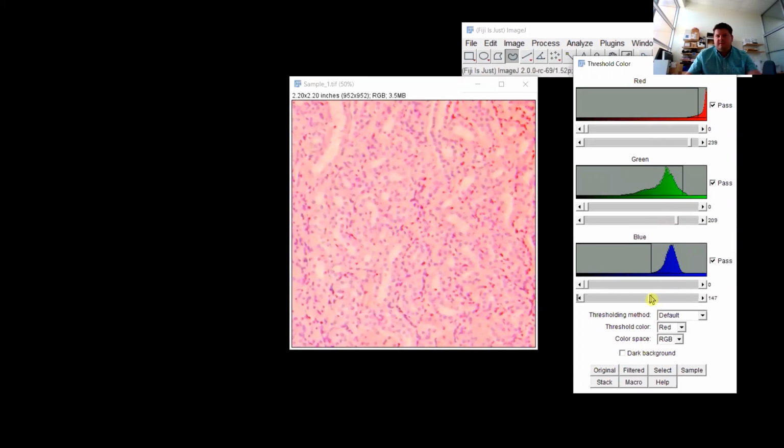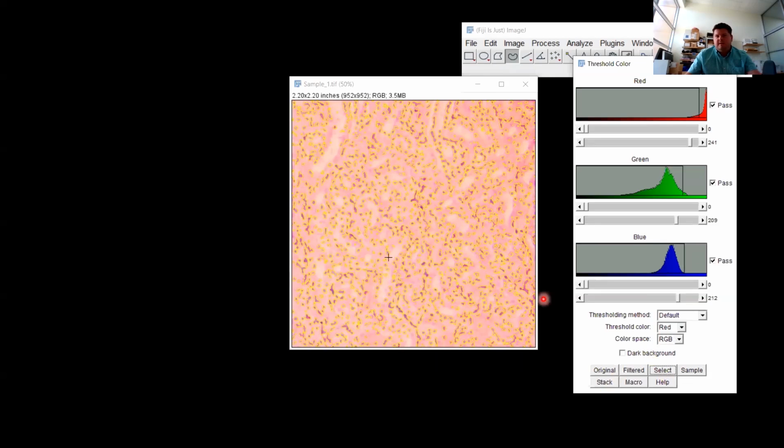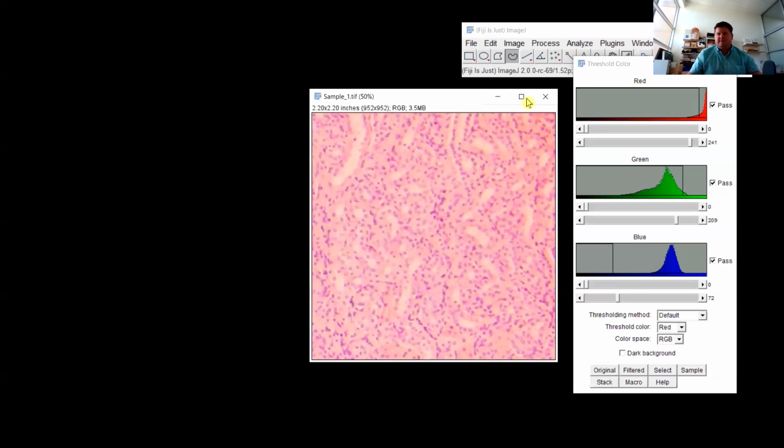You can adjust how much blue it's selecting. Obviously, it's going to need a lot of blue and red. Make purple. And then you can take things out like a select, and then it gives you the selection. You could then apply that to your ROI or invert it and fill the rest to do your counts. But it's not a common method that people use, but it is one that can be really useful with picking things in color images or non-classical fluorescence images.